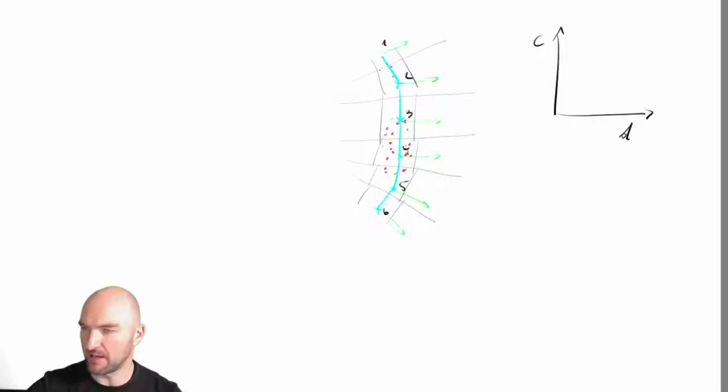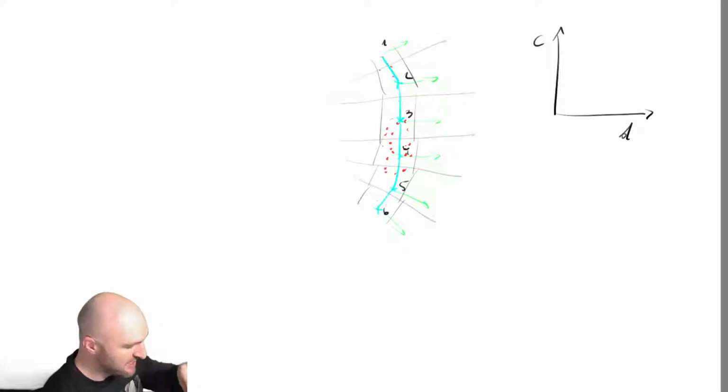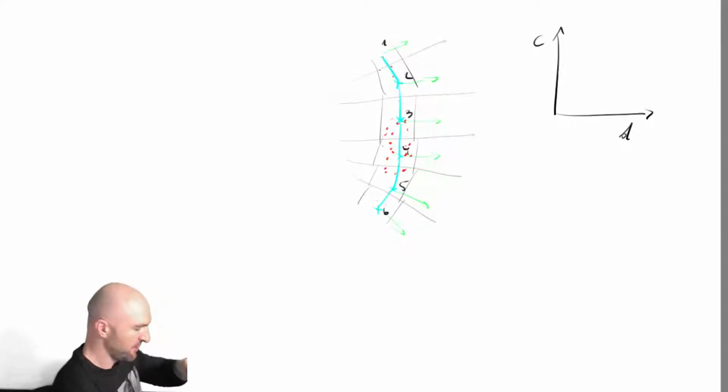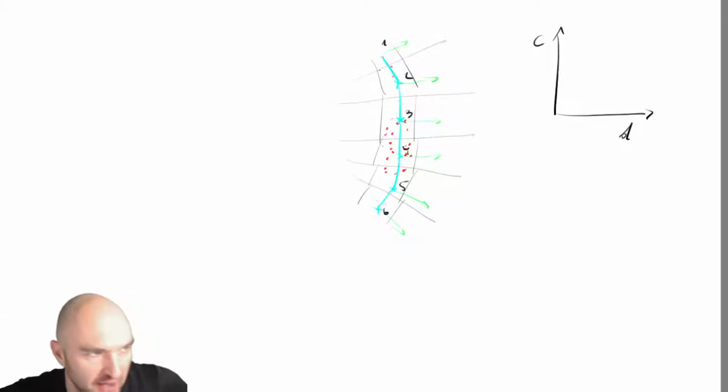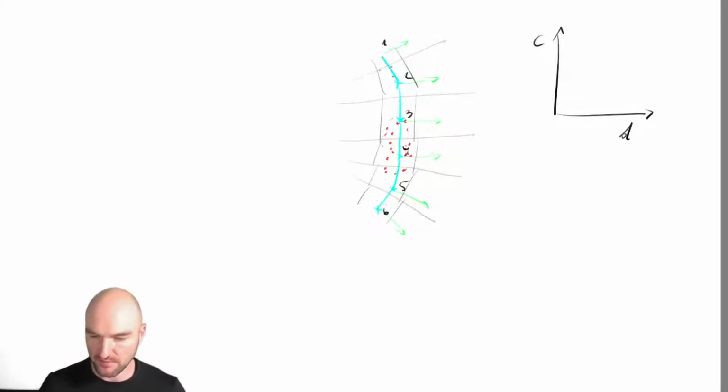For this data set, I'm not quite sure if there's too much uneven segregation going on. So I've got another one that's a nanocrystalline duplex steel, and that we might pull in later because there are actual concentration differences on the interface. Okay, so let's get started.